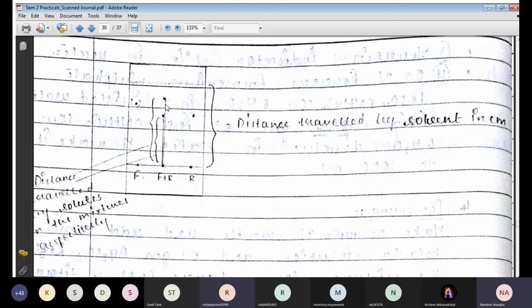Yes, ma'am. Okay. Now when we're talking about rhodamine, again the rhodamine in the mixture will cover the same height, same distance as that of the standard. Whatever distance, whatever height the standard rhodamine has gone to, the mixture will also cover that much height or distance. Similarly, the fluorescent will cover the same distance as in its standard, okay?